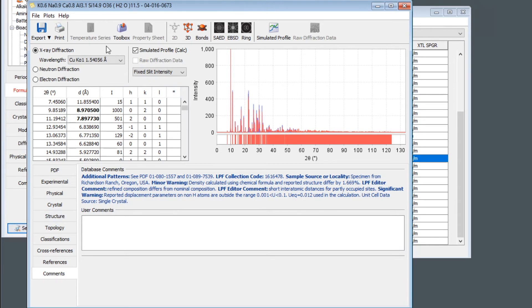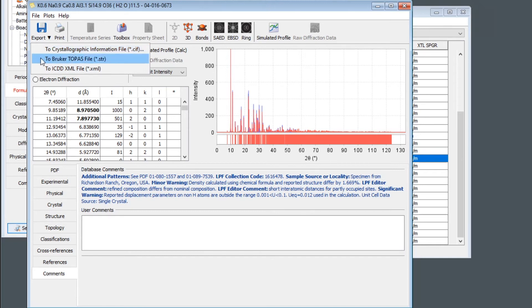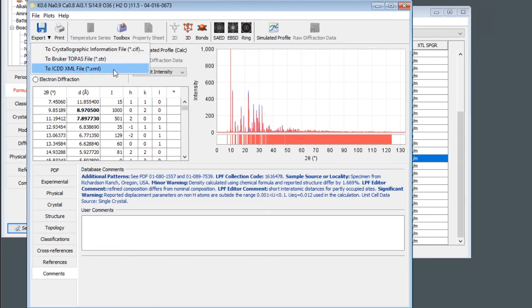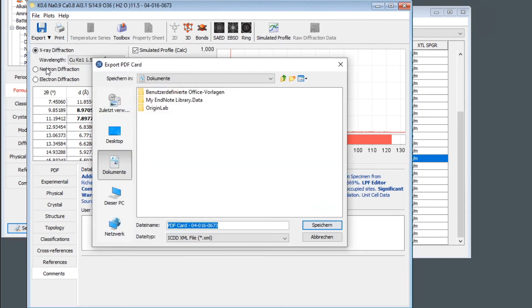But anyway, we can use this database record and try to import it in Profex. So we have to export it. And then we can choose between three different file formats. Again, the CIF format, which we already have, but from a different database. And there is a specific format for Bruker TOPAS files. It also uses the extension STR just as Profex, but it's not the same format. So we cannot use this format. And there is the XML format specific for the ICDD PDF4 database. And whenever we can use this XML format, we should use it because it's usually more complete than the CIF format. So I select this and I will export it to my documents folder.